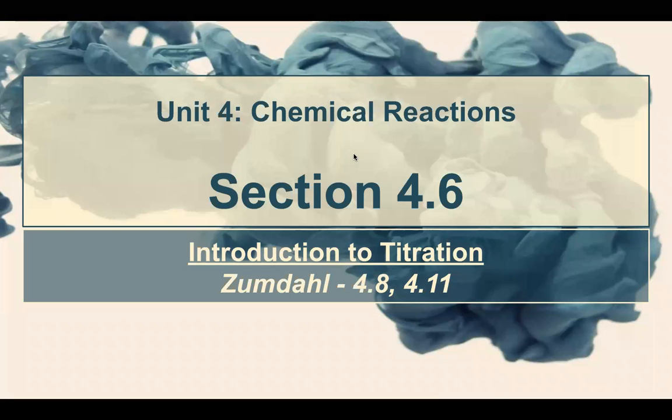Great. We are moving right along, section 4.6, and we're going to talk about titrations today. And this is going to be a really useful lab technique that we will use whenever we're back in the classroom. And it's useful to help to track chemical reactions.